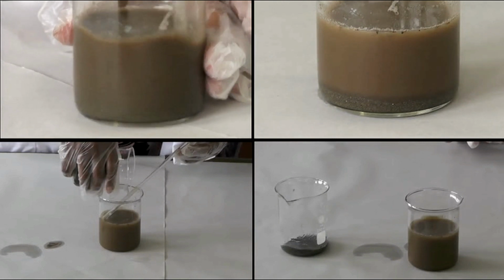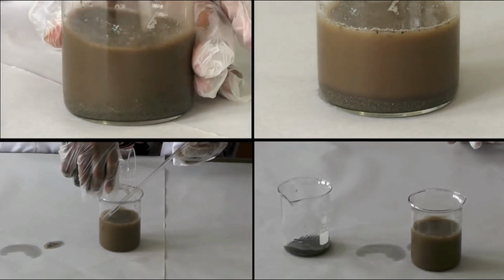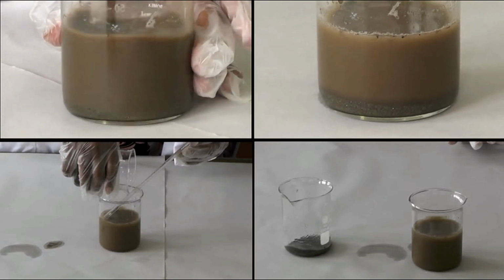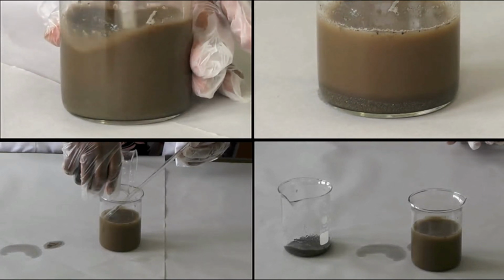Soil has separated from the mixture of soil and water through sedimentation. The sediments settled at the bottom of the beaker, and the decantation takes place by removing the liquid on top, which can then be poured off.